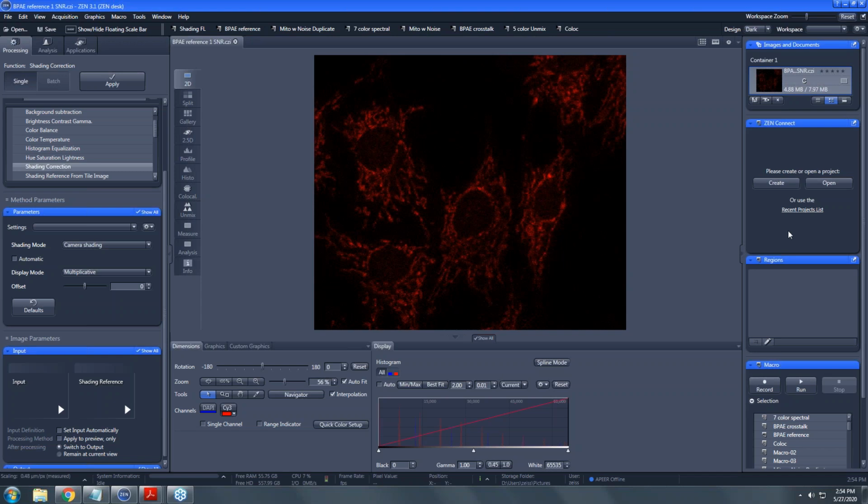So instead of acquiring the reference spectra experimentally, could you use the emission spectra that's available for a fluorophore as a reference for unmixing? So something from the company or published numbers, for example. Short answer, no. 2 reasons for that. One is that it's not implemented to do that. So the software just doesn't have the ability, although I guess we could fake it somehow, but no.